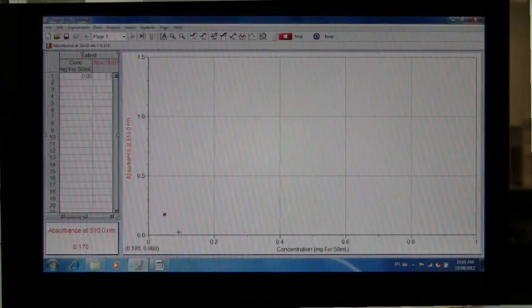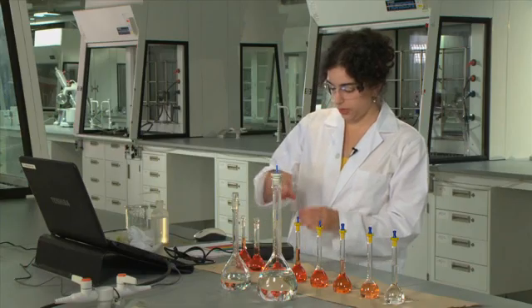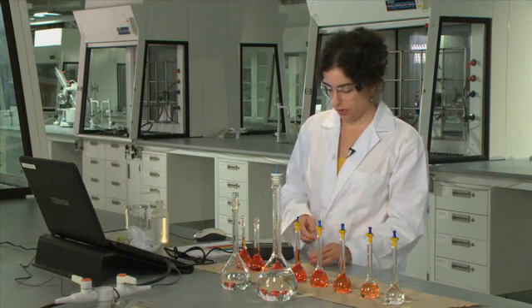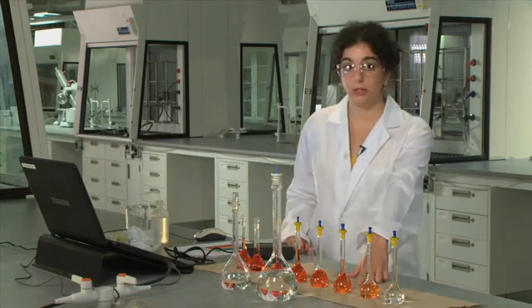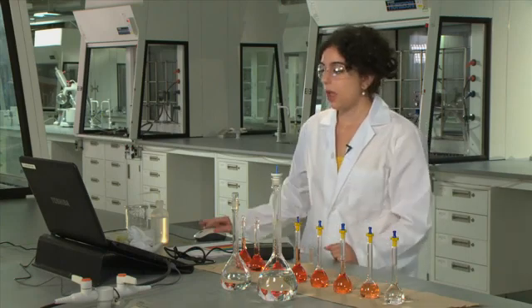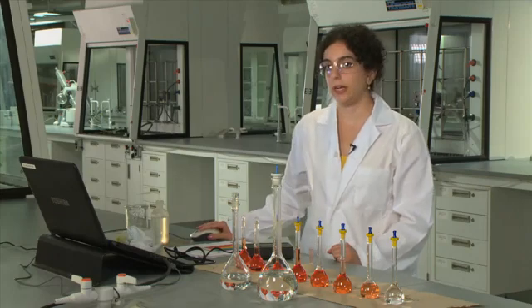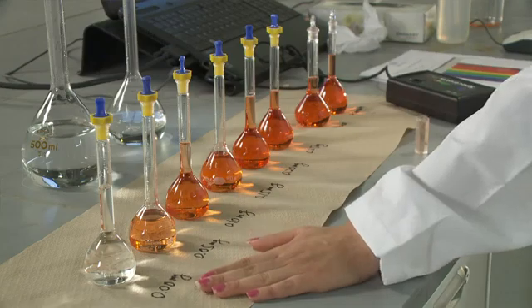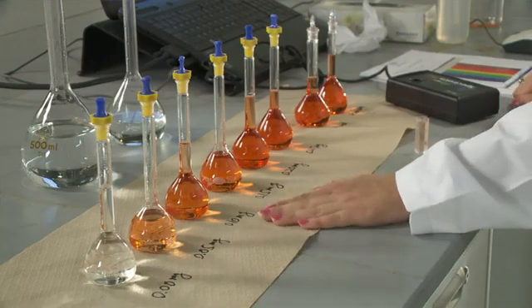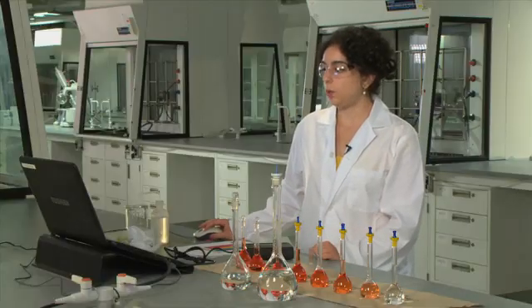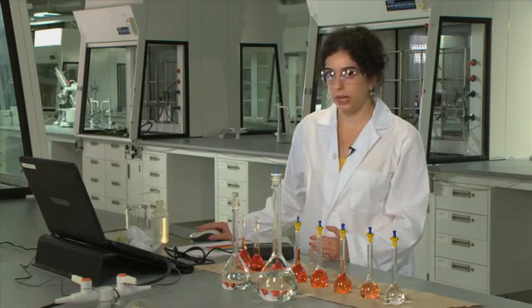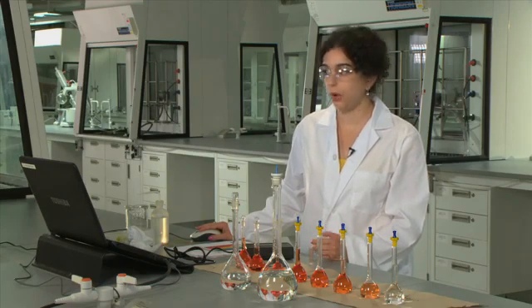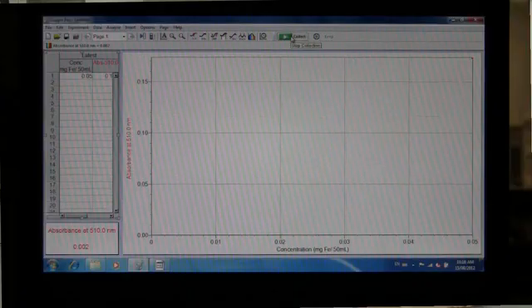And then the point will show up on the graph and also be recorded in the table. You'll then rinse out the cuvette and put in your next solution. And then you'll click Collect again and then click Keep. And you'll keep repeating this for all of your standard solutions. And once you finish collecting your data points, you'll then click Stop.